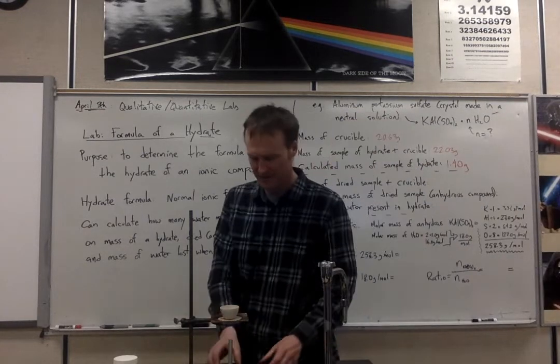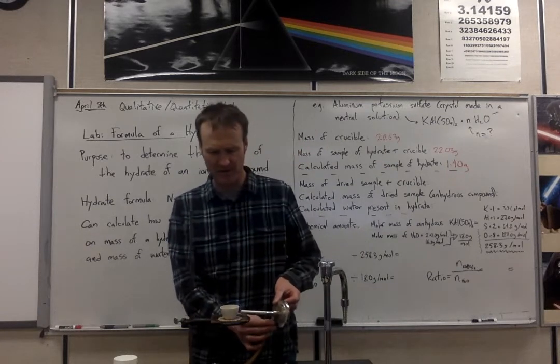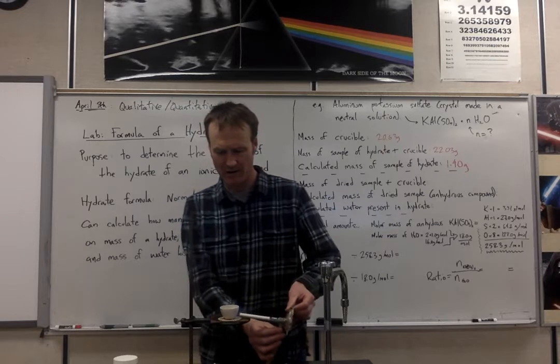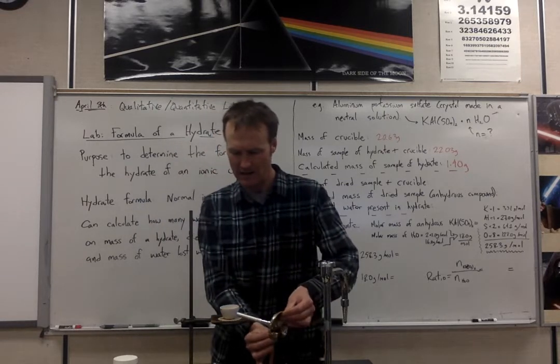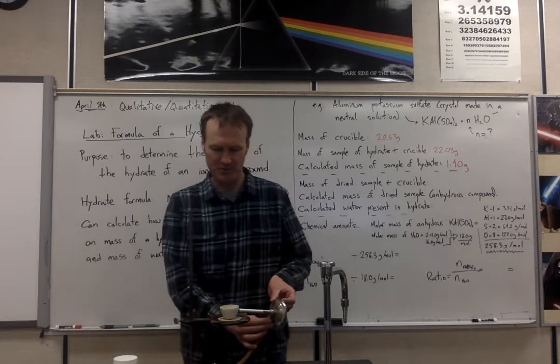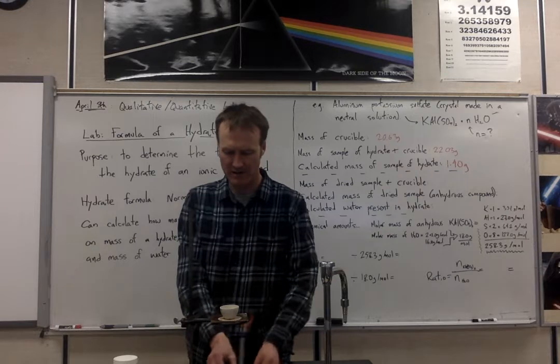Let's have a look at this. I'm going to put the flame on it a bit more, see if I hear any crackling. Okay. This is super hot. Just about ready.